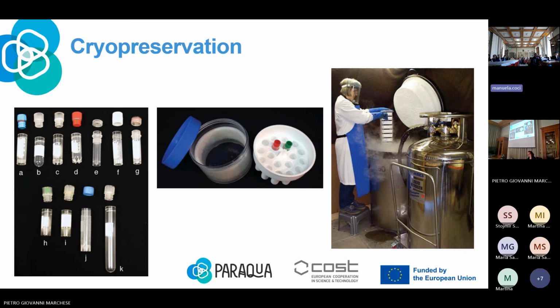If your culture collection is super big, you have to think about cryopreservation, and also some cyanobacteria, some strains, can survive this process. Worth noting is that some of them can produce akinetes, so the population can renew from the akinetes after such treatment. But this is not universal, and the strains can considerably differ in their ability to survive cryopreservation.